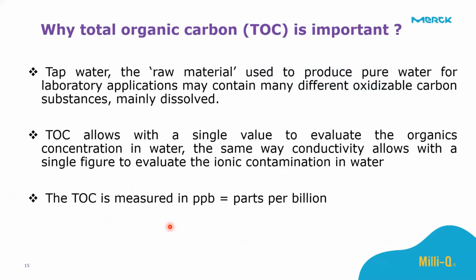So basically, tap water, we said, of course, is the raw material that is used to produce pure water for laboratory applications. And when it comes to organics, it may contain a lot of different oxidizable carbon. So basically, TOC is total oxidizable carbon or total organic carbon. With TOC, we normally get to know how much organics we have in this water. TOC is normally measured in parts per billion.